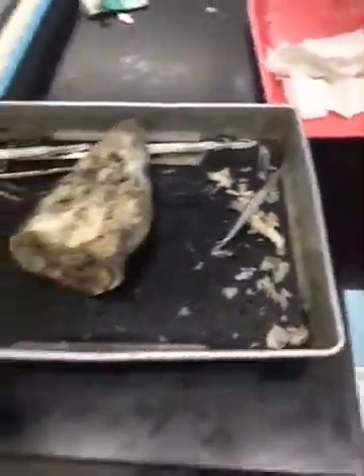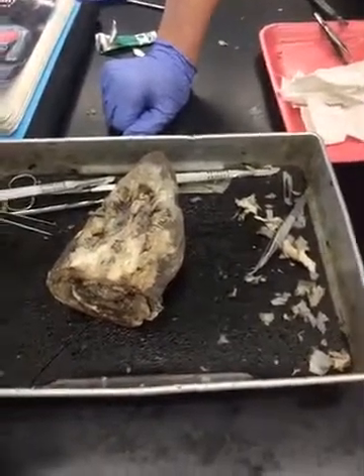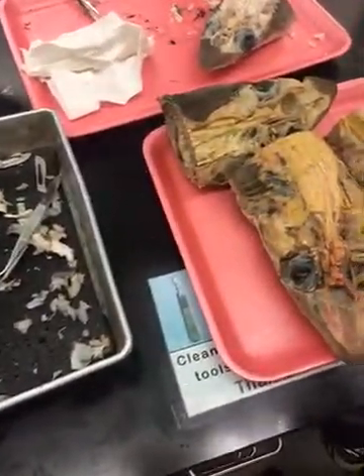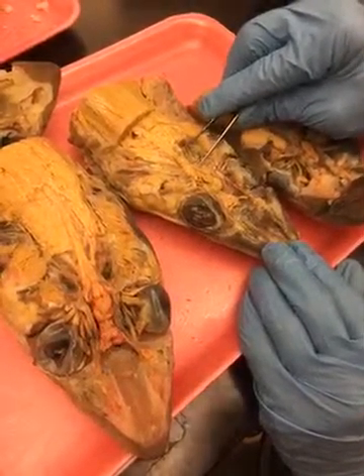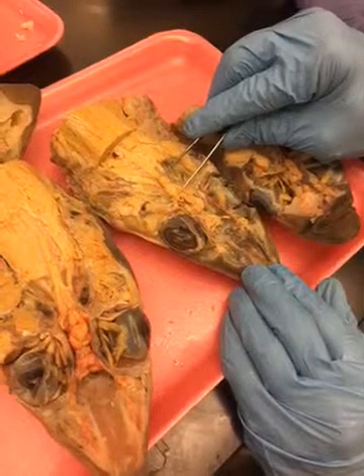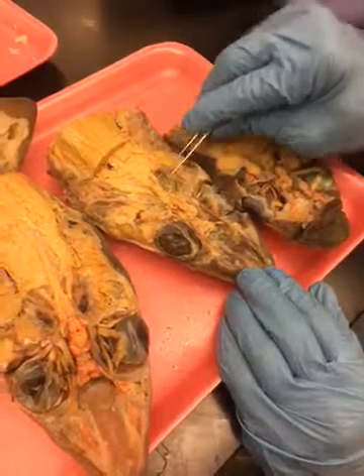Auricle is spelled with an AU, not an O. Auricle is an ear, not as in the oracle of Delphi. And so that's metencephalon. Then after the metencephalon is the myelencephalon, which consists of this medulla oblongata here. So myelin with a Y, M-Y-E-L, myelencephalon, formed by this medulla oblongata.